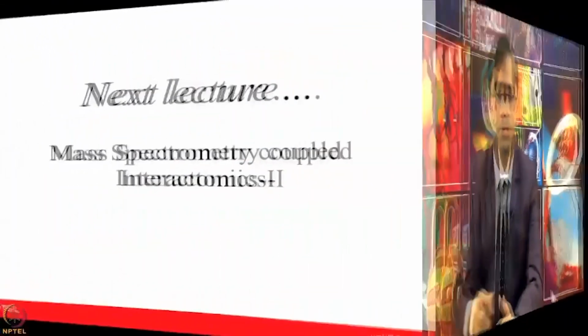In the upcoming lectures, we will also discuss coupling of immunoprecipitation with mass spectrometry to detect and identify the interacting partners and the molecules of your interest. I hope these novel technology platforms which we discussed in the last two lectures and in the upcoming lecture will make you much more aware of available technology platforms for your applications.